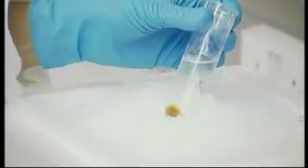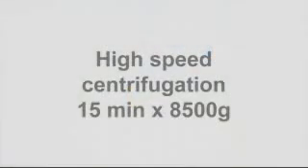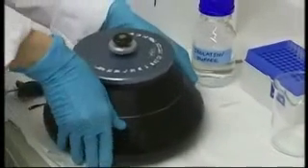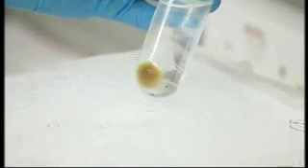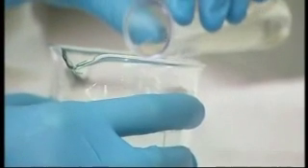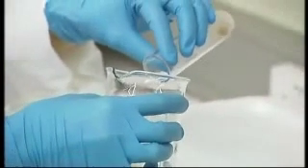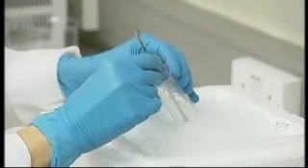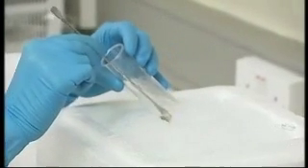Discard the supernatant. Re-suspend the pellet in re-suspending buffer and centrifuge again at 8500g. The resulting brown pellet contains washed intact mitochondria. Re-suspend the pellet in a very small volume of re-suspending buffer. The lower the volume you use, the more stable the preparation of mitochondria will be.